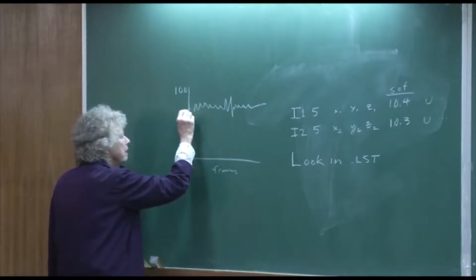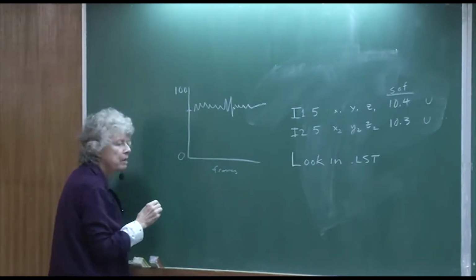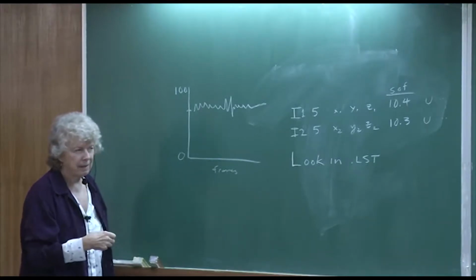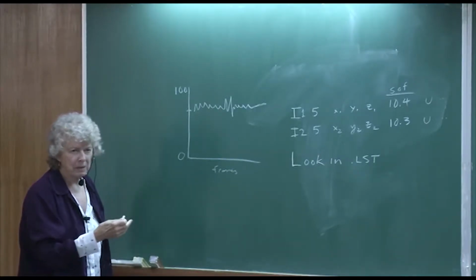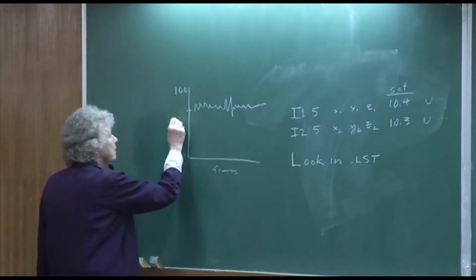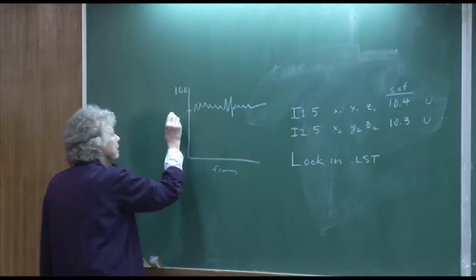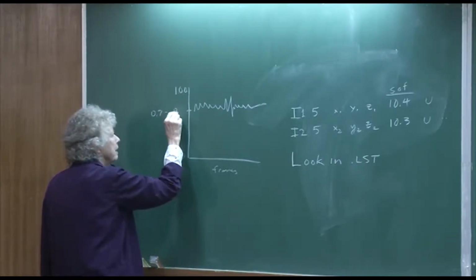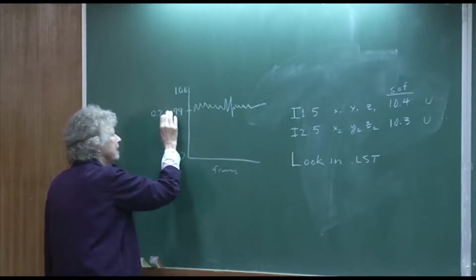You want this to be preferably more than a half, because if it's a half or less, you may have the wrong space group, for one thing, and it's just not very good correlation. So I like this to be, I guess this is 1, so between 0.7 and 0.99 is the best.